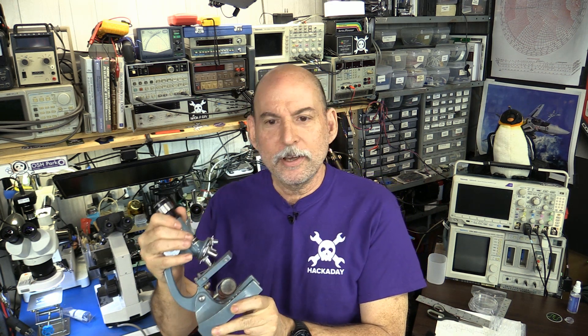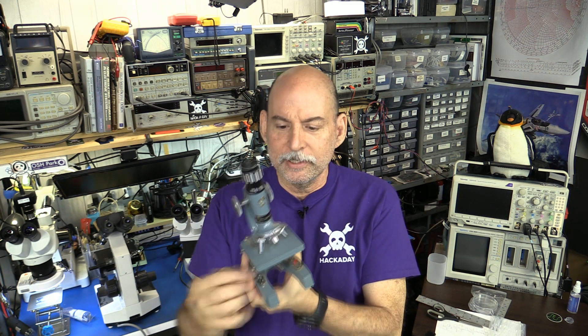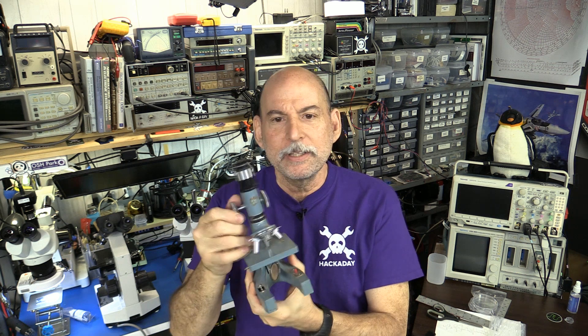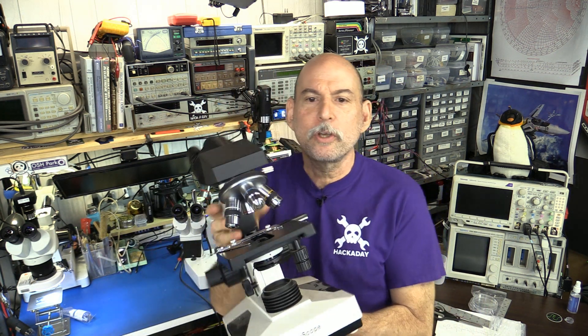Long before I got to high school I had a microscope. I got this when I was eight years old — this was my pride and joy. It cost the equivalent of one of these did back then, and I ran all over the countryside gathering up little vials of water to look under it, and my finger hurt from poking it so I could see blood under the microscope. This thing was just awful — it used AA batteries for a tiny light bulb, had a mirror, everything was loose, but it had a magnification of 900. So I had gotten my son the same kind of microscope, costing the same as that did back then, and this is what we're going to use to look at mitosis.